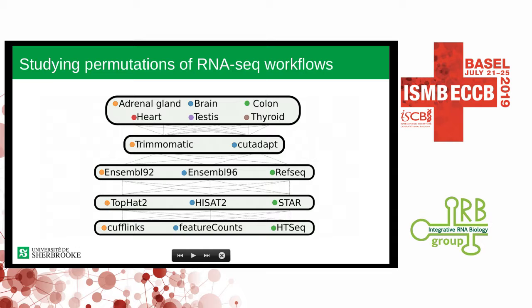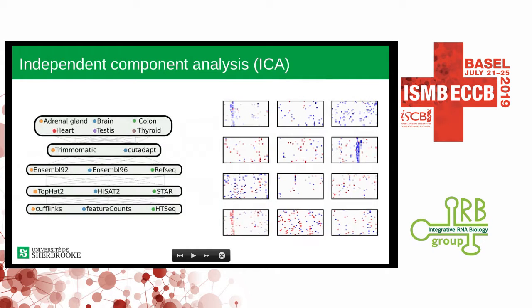With this idea in mind, I went with a permutational study of RNA-seq workflows, mainly selecting a few human healthy tissues and some of the highly used tools I found in the literature and using two different versions of Ensembl. You'll see why later on. I computed every possible permutation of tools in this matrix, which gave me a pretty big count matrix. To analyze this data, I used an independent component analysis, also known as ICA, which is a dimensional reduction technique, which lets me draw sources out of this dataset.